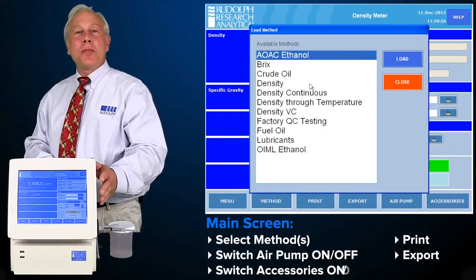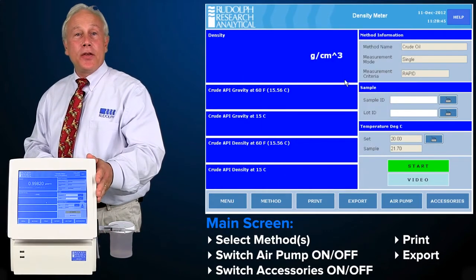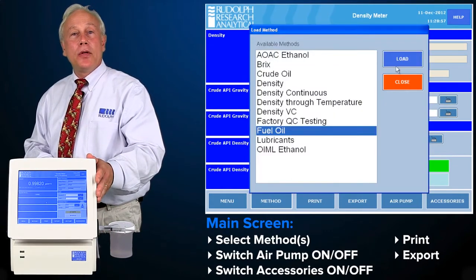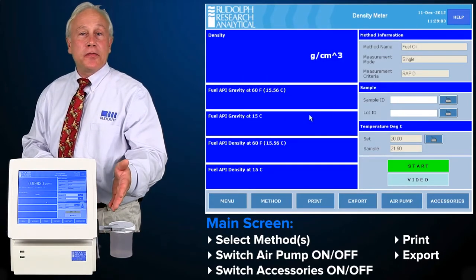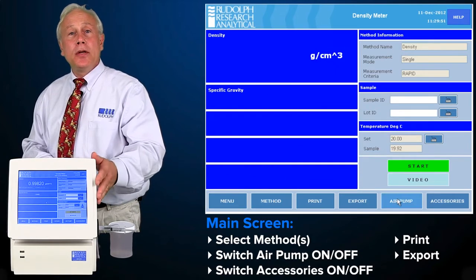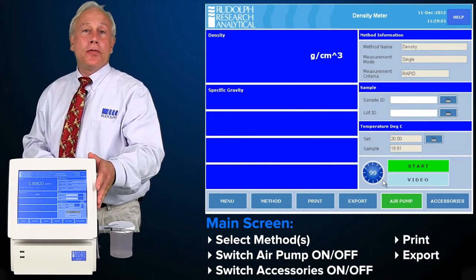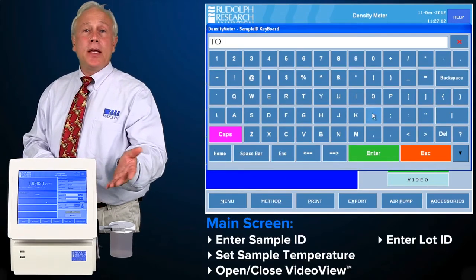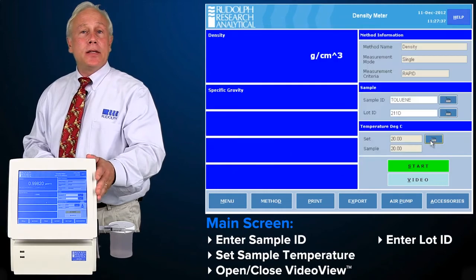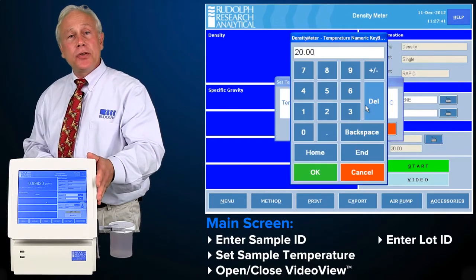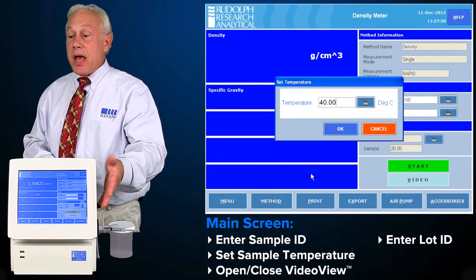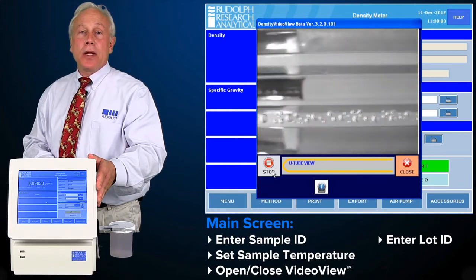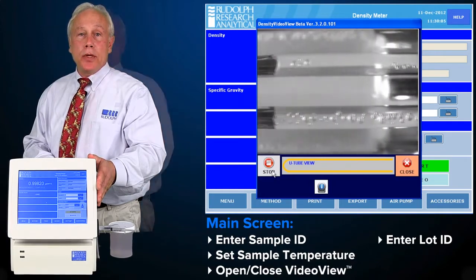From the main screen, all common and daily used functions are readily available. You can select different methods, print, export, turn on and off the air drying pump. You can enter sample ID and lot IDs, set temperatures, and access video view. All of these functions are readily available for you.